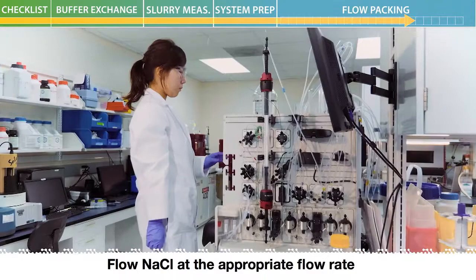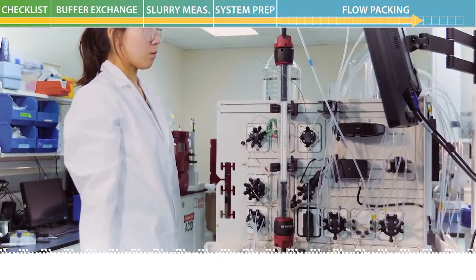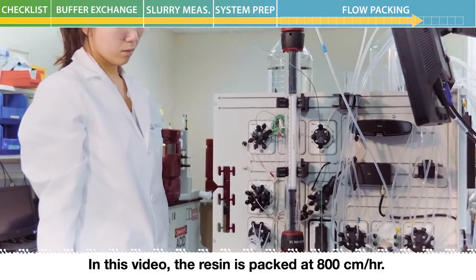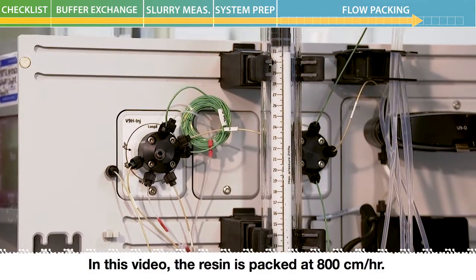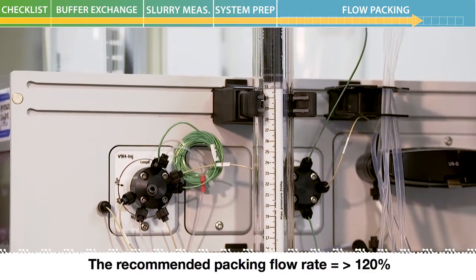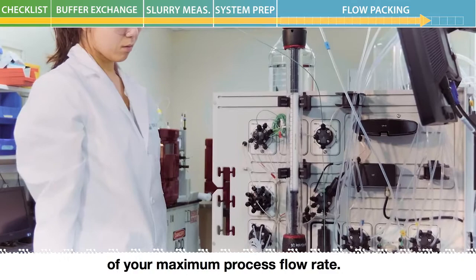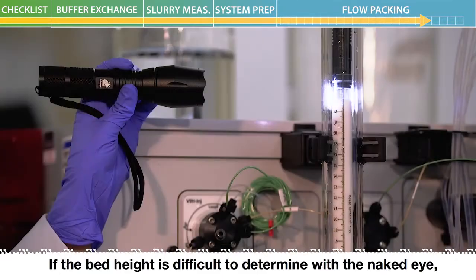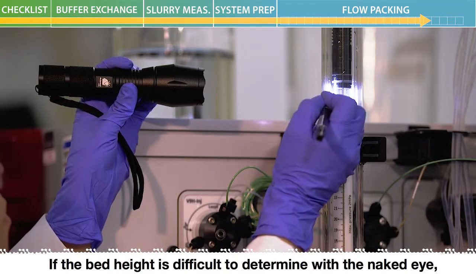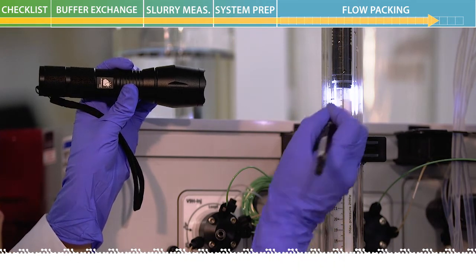Flow sodium chloride at the appropriate flow rate until a constant bed height is obtained. In this video, the resin is packed at 800 centimeters per hour. The recommended packing flow rate is equal to or greater than 120% of your maximum process flow rate. If the bed height is difficult to determine with the naked eye, use a flashlight to reveal the height and then label it with a lab marker.